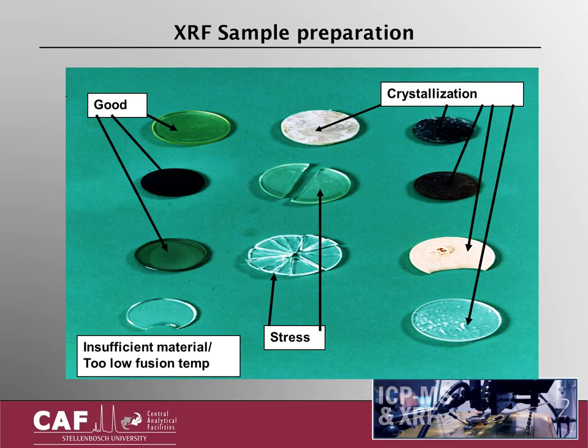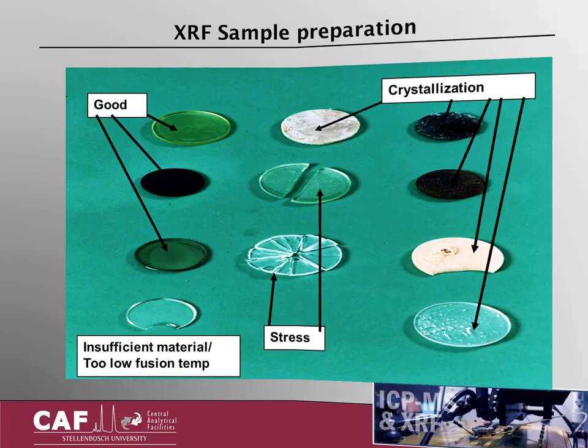It takes adequate knowledge and experience in all aspects of the process to deliver good quality fusions. The analysis will only be as good as the fusion. Lacking this expertise may allow for problems to occur, such as non-filling of the mold, cracking or crystallization, bubbles in the fused bead, bead sticking to the mold, and inhomogeneous dissolution. The aim is to create a good fusion which is perfectly flat and completely homogeneous.